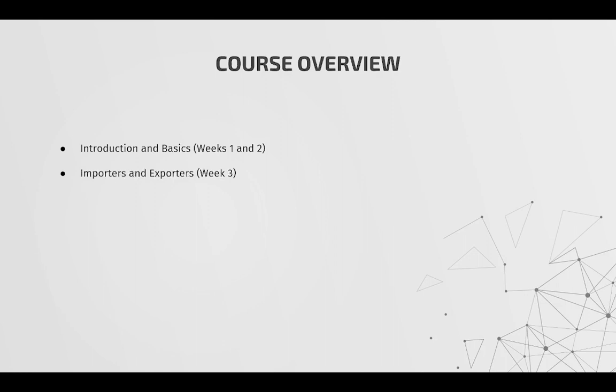In week 3, this will be where we first introduce the IOLITE Python API. There is quite a bit of a steep learning curve for this week. It's unfortunate that's just the way it will have to be, but we will be introducing how to access the objects within IOLITE and also giving you a taste of some of the libraries we use, such as NumPy and Pandas. We'll also be looking at some of the simpler modules, such as importers and exporters.